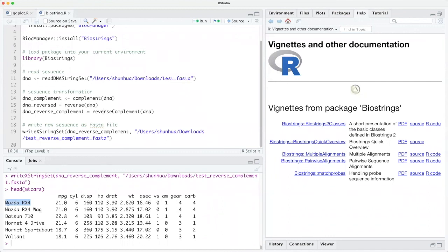So you can use the index to target one single row easily. The most important thing is that it's different from the columns. It's not in the original data frame, but you can definitely. Sorry, I meant in your Biostrings result, you have a number 1.